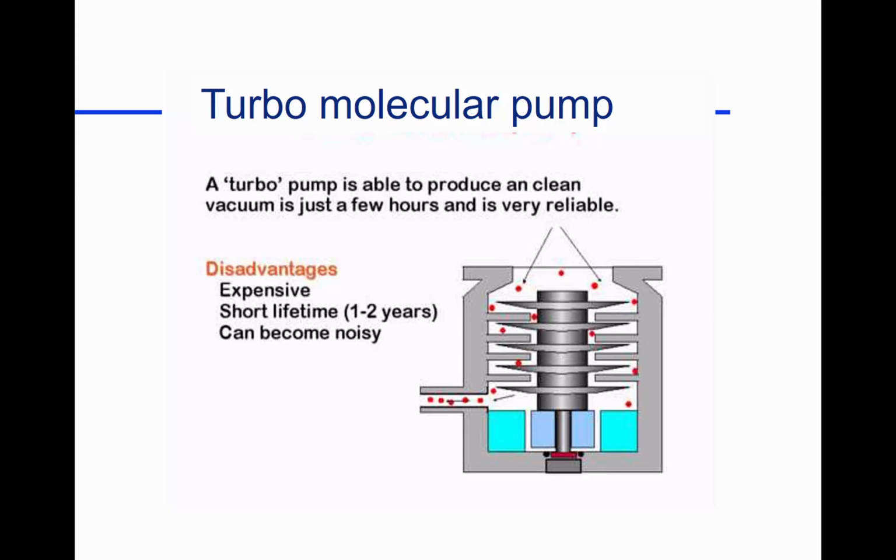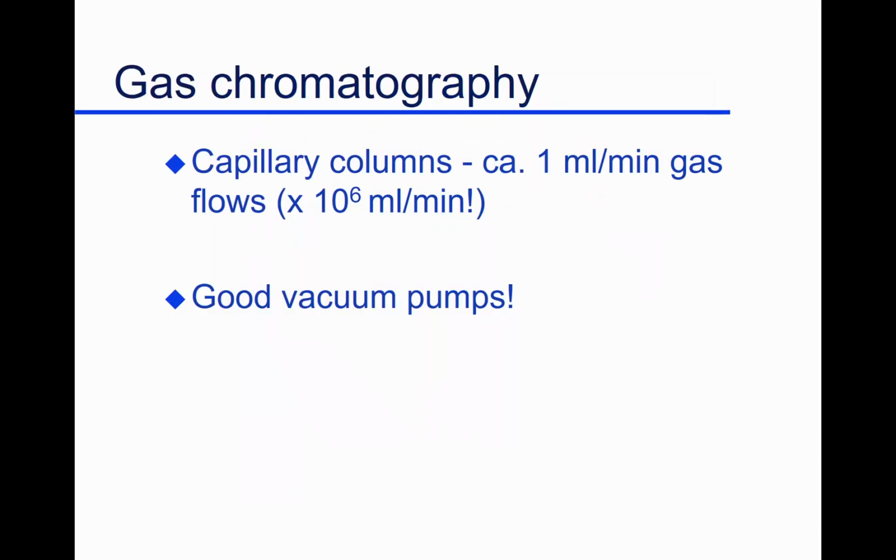This is a turbo pump. It's rather interesting that you actually do have a system where there's a rotary turbine in there. This turbine is spinning and moving gas out of the system. And this spins about 55,000 revolutions per minute, 24 hours a day for years. It absolutely amazes you what they must have for bearings and how they keep something like that running. That's the most common. They say a short lifetime, 1 to 2 years. Probably 5 years is more reasonable. They will run on that basis, 55,000 RPM, for that time period. Then they need to be rebuilt, with new bearings in them.